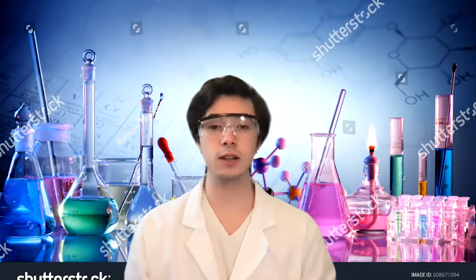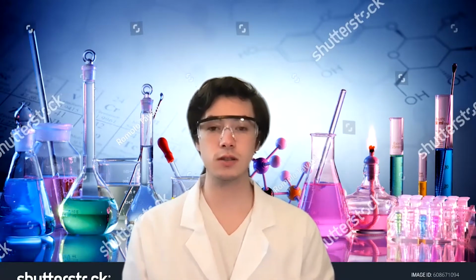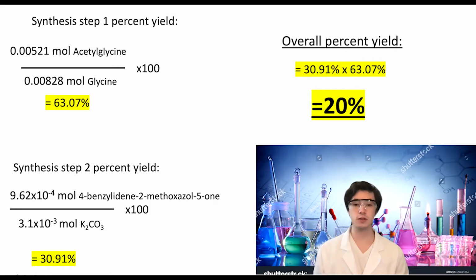Now we have to calculate the percent yield of each synthesis reaction. For the first synthesis reaction with glycine as our limiting reagent, we get a percent yield of 63.07%. And for the second synthesis using potassium carbonate as our limiting reagent, we get a percent yield of 30.91%. Multiplying these two percent yields by each other, we get a total percent yield of around 20%.